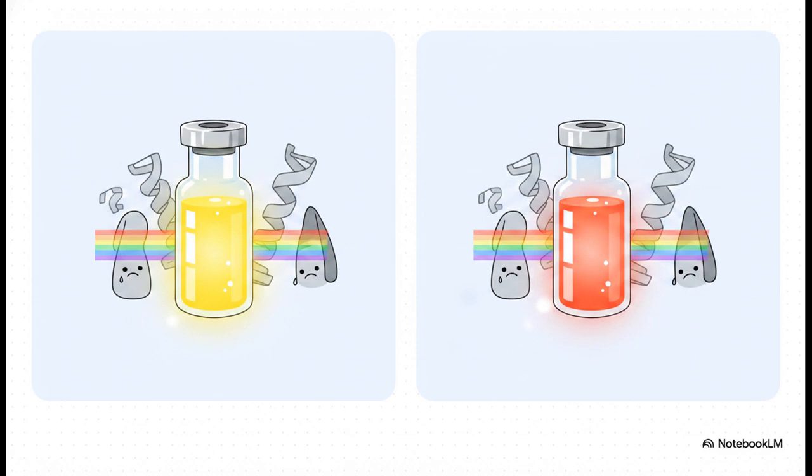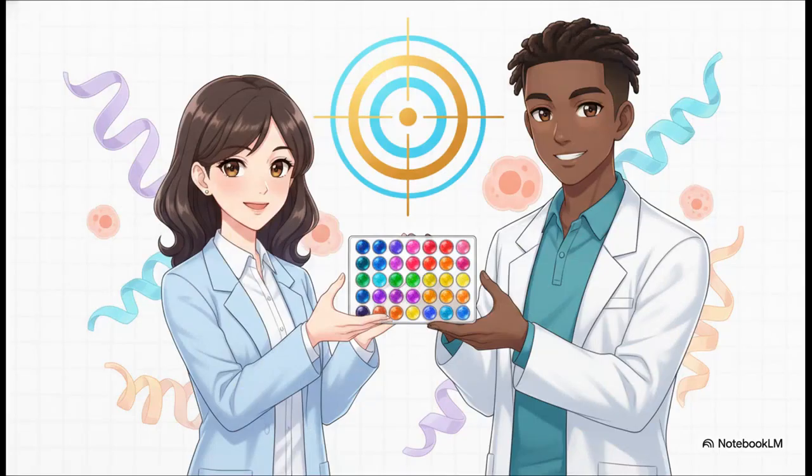This is huge because it allows scientists to completely bypass the invisible UV spectrum and move into visible light, totally ignoring the UV protein interference that ruined those earlier experiments. These modern stop-bath assays are just fantastic.